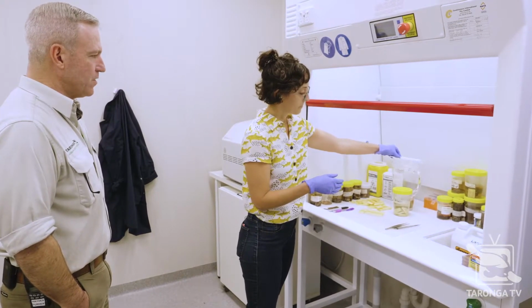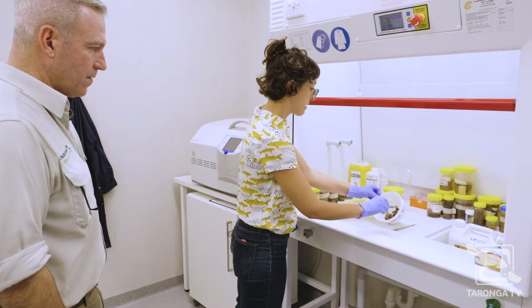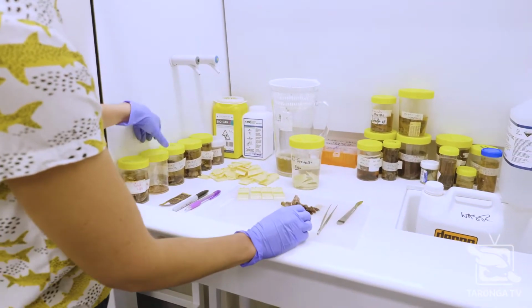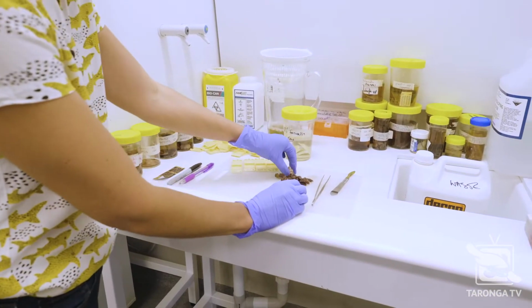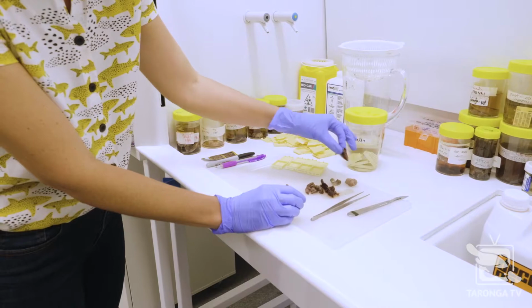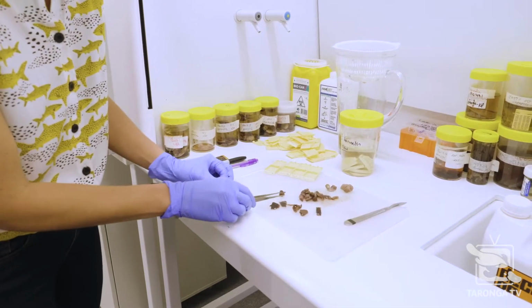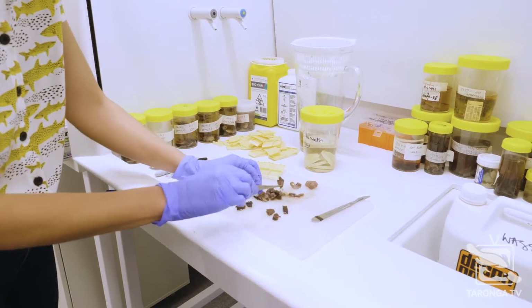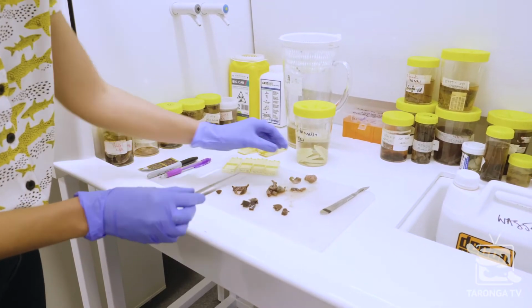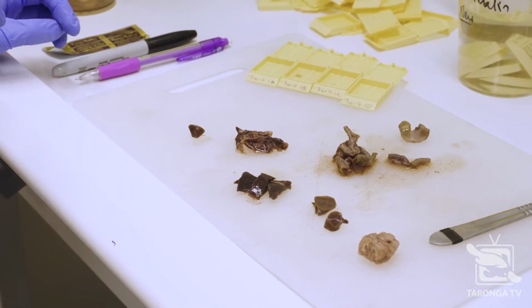Yeah, right. So you've just drained that. Yes, I have decanted our tissues and the formalin is now removed. So this is one of a group of ring-tailed possums I examined last week. And now it's really just a matter of me going through and isolating all the bits and pieces that I need to look at to complete my investigation of this animal's death. So we've got, they're all very little. We've got kidneys there, that's a piece of lung, another piece of lung here, some liver, more liver, that's the intestinal tract, that's the heart, and then the brain, which I usually do last. Quite incredible.